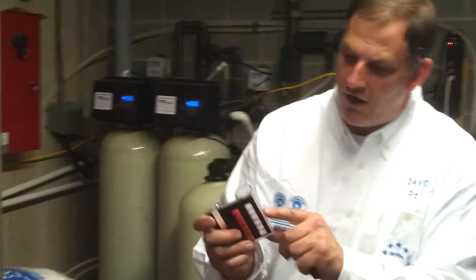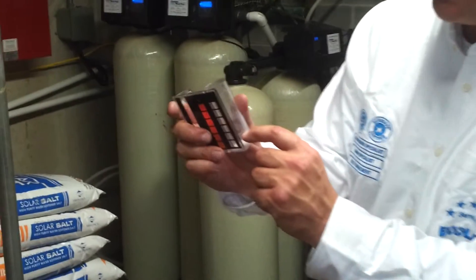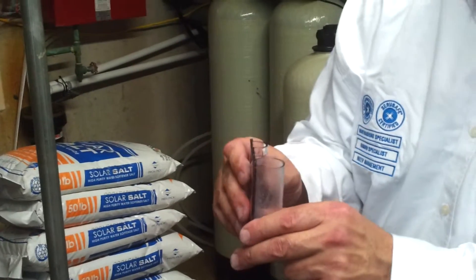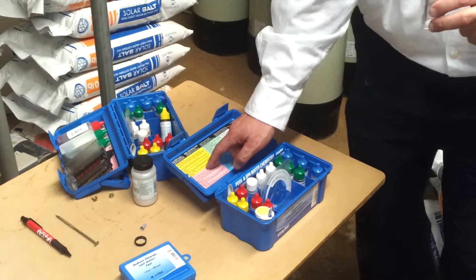To do that test, there are hash marks on the side of the bottle. There's a 10 milliliter hash mark, and that is what we're going to fill up to in order to get our sample for the free chlorine reading. The instructions and everything I'm going over are listed step-by-step in the yellow section.